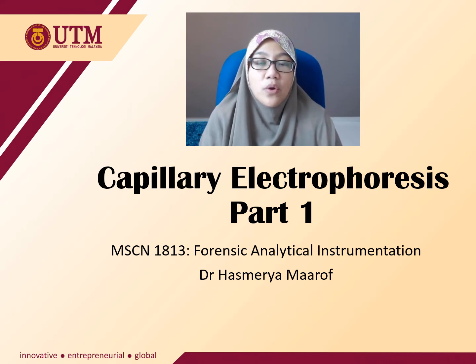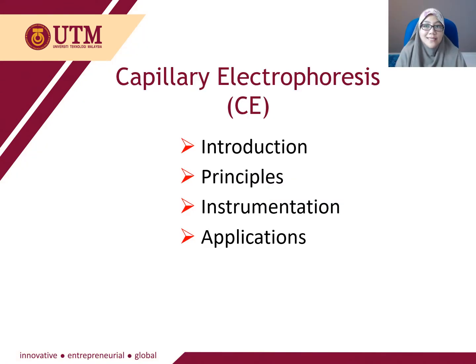So, in this topic, we will cover capillary electrophoresis. It's quite a long topic, but we will discuss one by one, and I hope you will get all the information for this topic. In capillary electrophoresis, we will divide the topic into introduction, principles, instrumentation, and also application. Dan dalam application kita akan discuss beberapa contoh-contoh secara spesifik how CE is used in forensics.